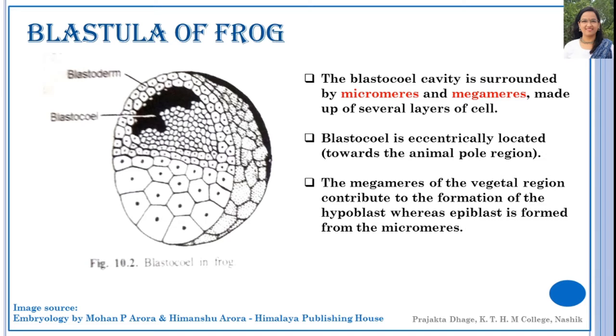Here, in such cases, the blastoderm is no longer a simple cylindrical epithelium; it is made up of 2 or more cells thick. In the interior, the cells are loosely connected to one another, while they adhere to one another very firmly and very tightly towards the external surface. The adhesion of the cells is due to the presence of cementing material. On the outer side it will be tightly bound, and on the inner side the cells are going to be loosely bound. So this was about the blastula of frog.